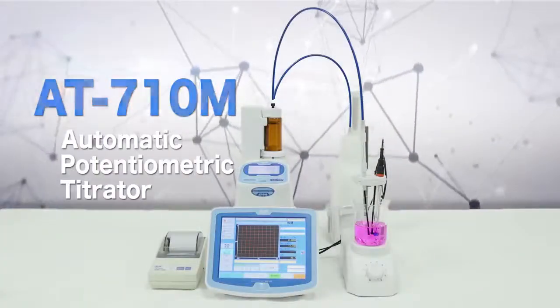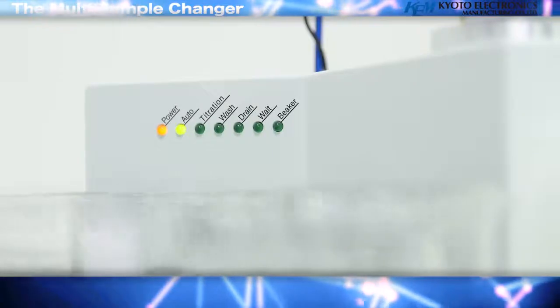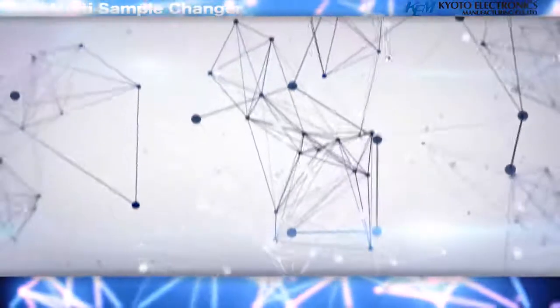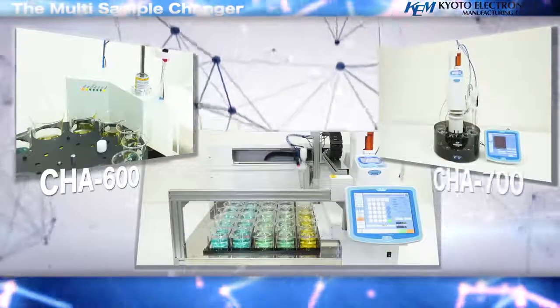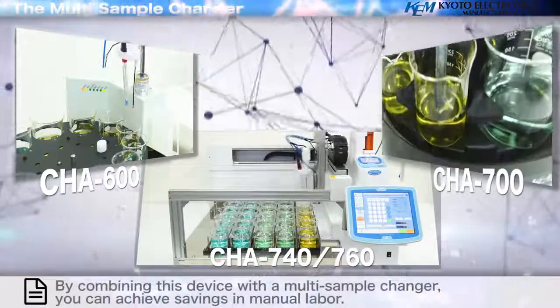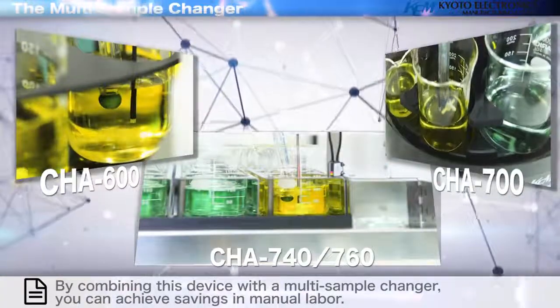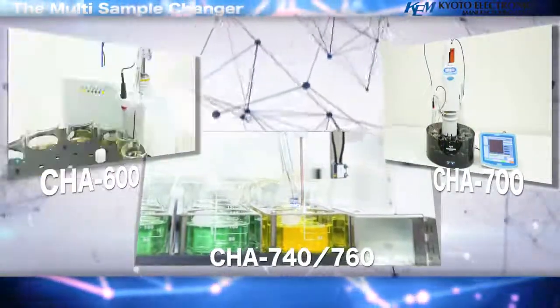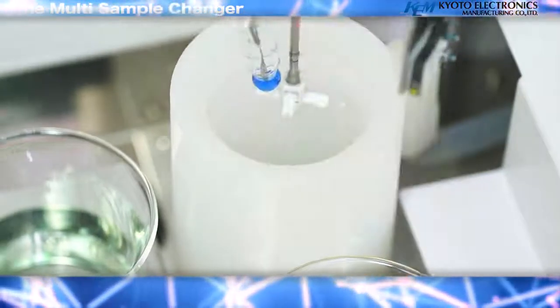The multi-sample changer: by combining the AT710M with a multi-sample changer, you can increase productivity resulting in cost savings. By connecting the multi-sample changer CHA600, CHA700, CHA740, or CHA760, one can perform analyses of the same sample continuously or analyze different samples repeatedly. In addition, it is possible to clean the electrode after titration and automatically drain the solution in the beaker.